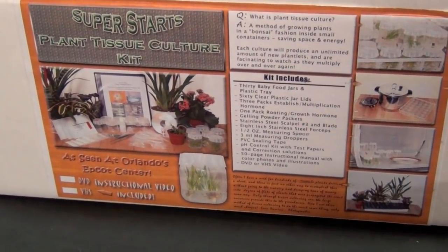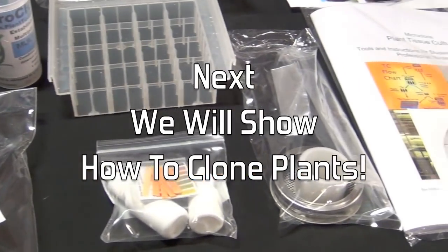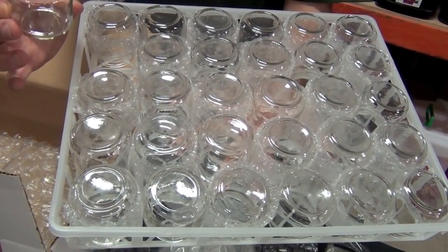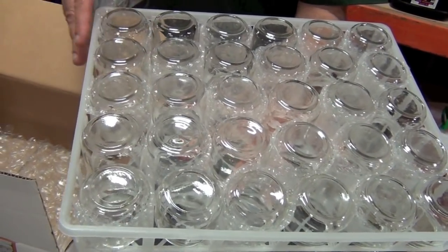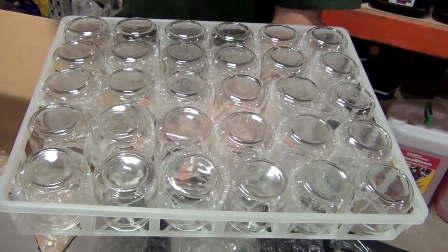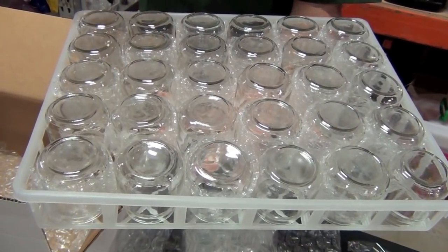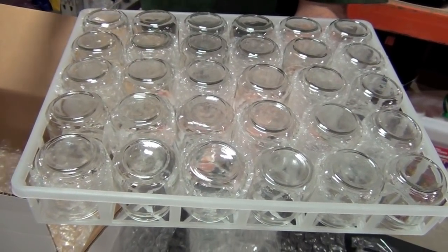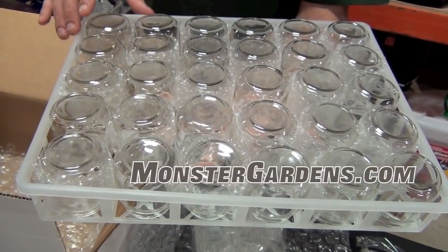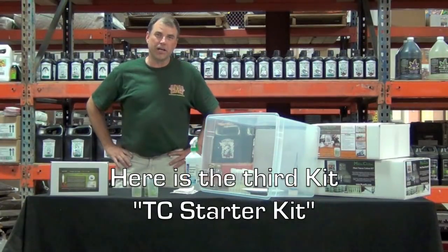The SuperStarts Plant Tissue Culture Kit comes with all you see here. These are the baby food jars in the custom made tray. They'll actually be sterilized in the pressure cooker. Another reason I choose polypropylene for these trays is that users who are doing several of these at a time — some have picked up secondhand autoclaves, dental autoclaves, or tattoo autoclaves — can put all the jars in the tray and the tray can go into the pressure cooker too.